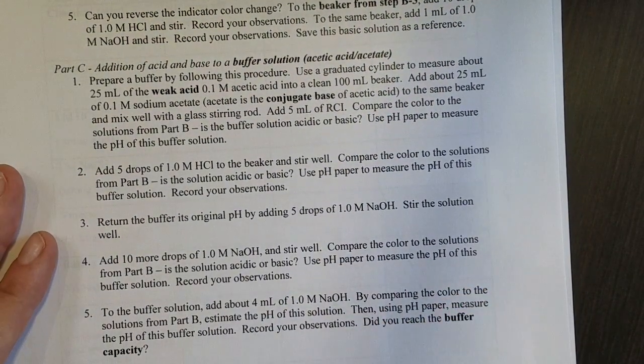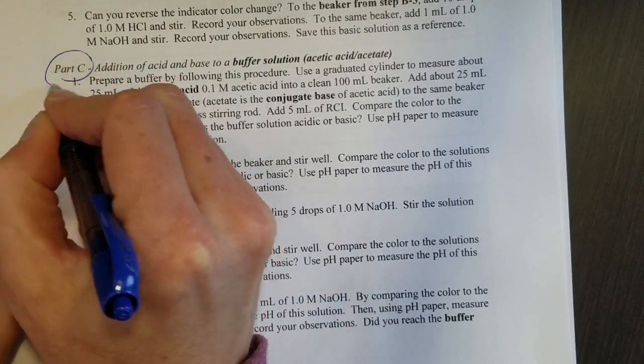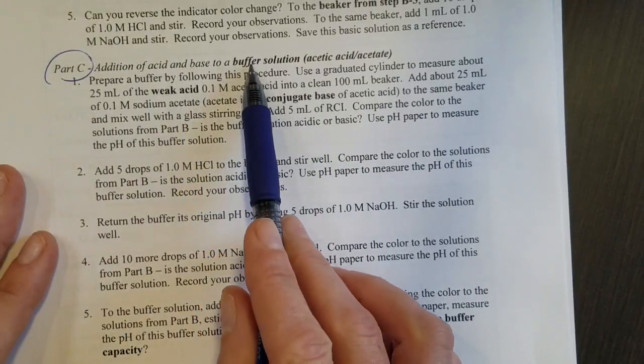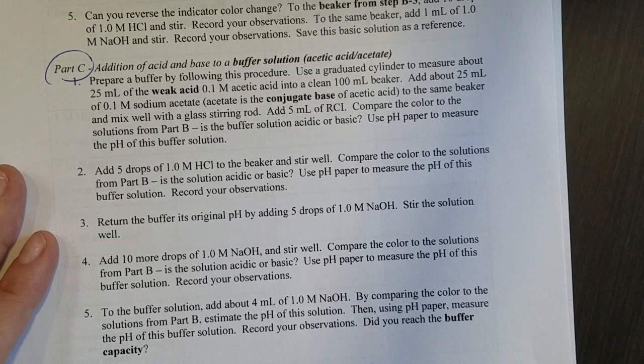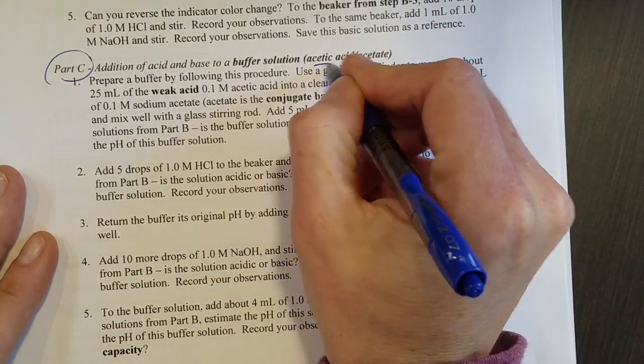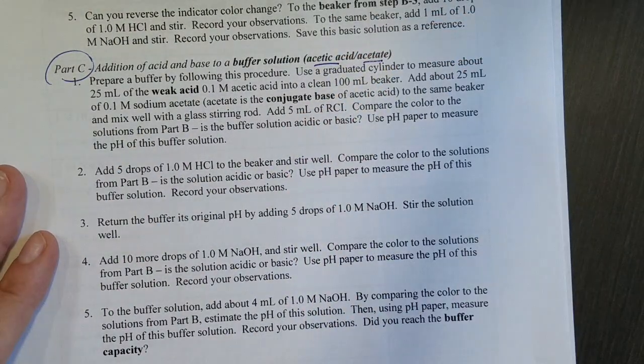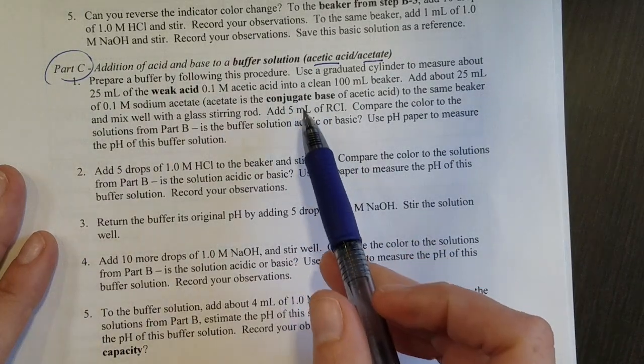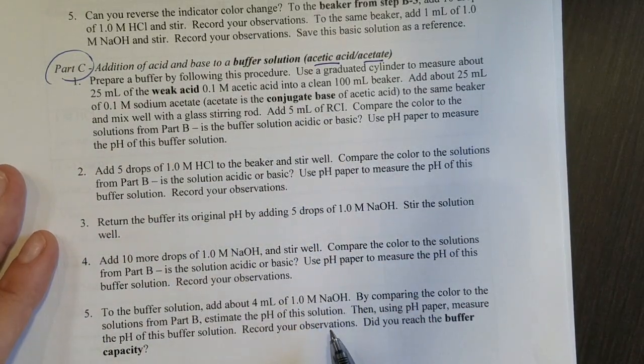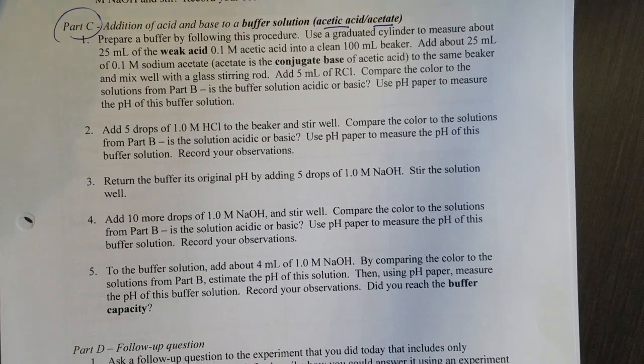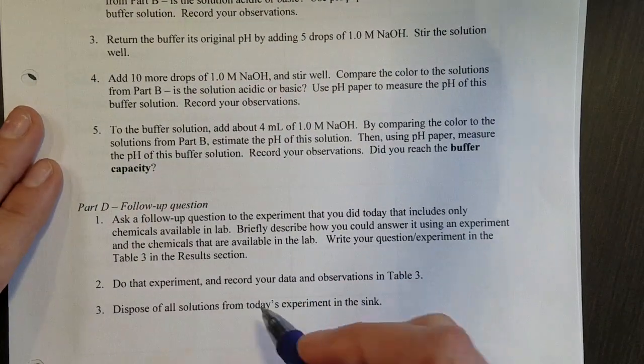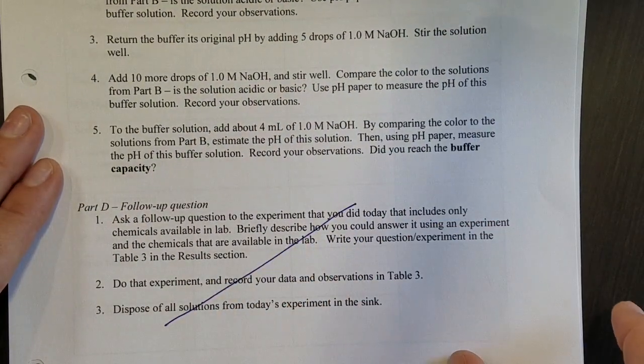And then in part C, which is where we'll spend most of our time focusing, we're going to have a buffer solution and so that's going to be some water but also with the weak acid and the conjugate base. So you'll observe all of these steps being taken and then if we look at the bottom here, normally you would design your own little experiment, but we're going to skip that today.